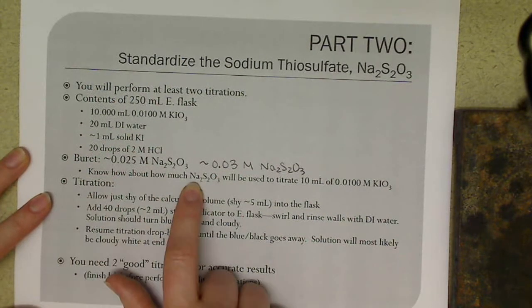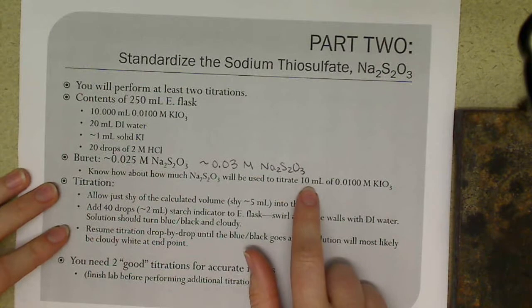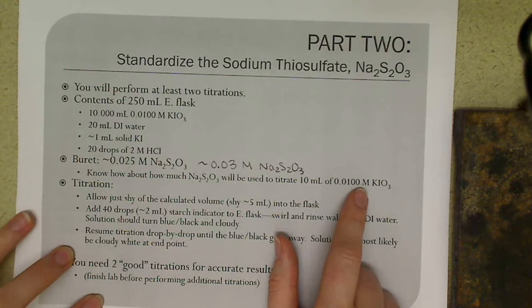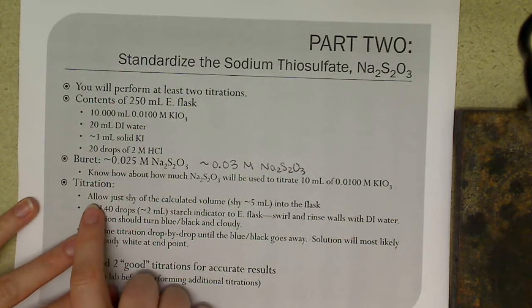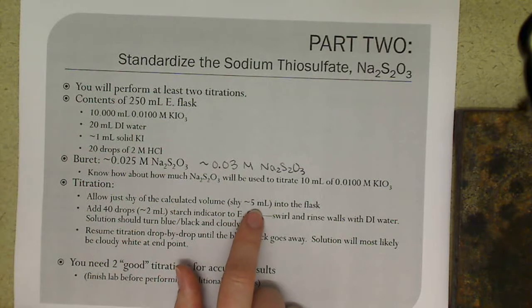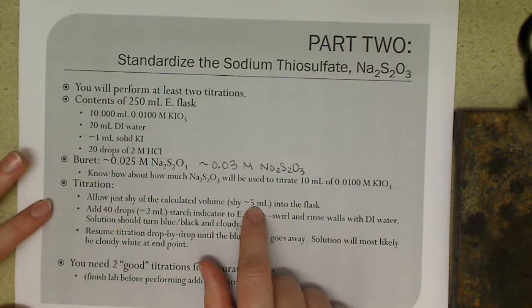You need to calculate how much of that sodium thiosulfate, again, use this value, that's going to be needed to titrate 10 mils of this solution. You need to know that, and that's because we can't add the indicator until you're close to the end point. So you're going to titrate just shy of your calculated volume, so shy about 5 milliliters. I would err on the larger side of that, so maybe between 5 and 10 milliliters, not less than.